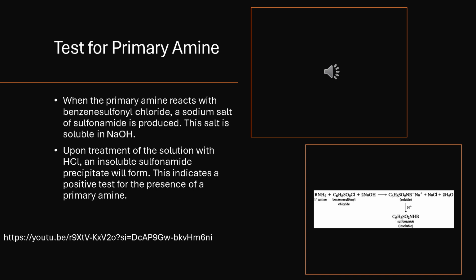And please make sure to watch the YouTube video that I put the link to in this slide. It is at the lower left of the slide, just to see how the positive test or the negative test will look like in real life, in the laboratory.